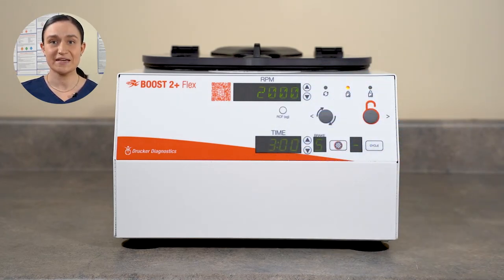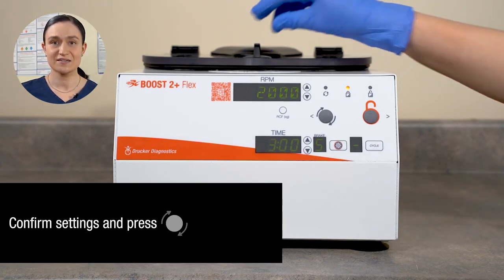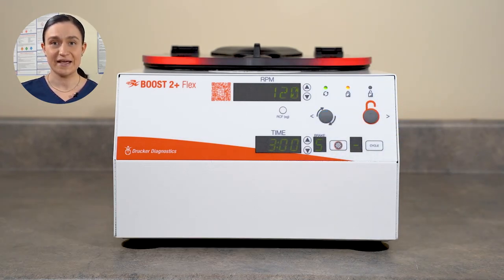Once our settings are displayed as desired, we check that our lid is closed and latched, and then press the start button. The centrifuge will start spinning. Once it reaches the programmed RPM, the timer will start counting down. Once it has run the full time, the centrifuge will begin to slow down, applying the brake as set.